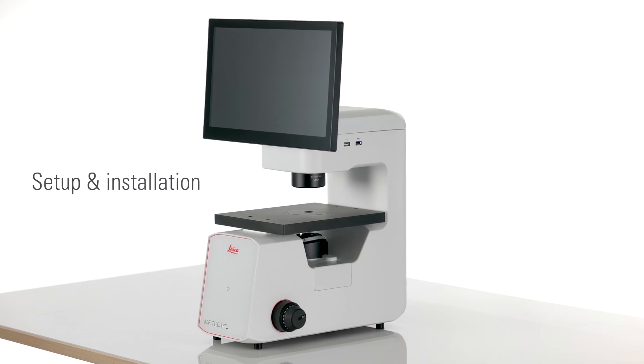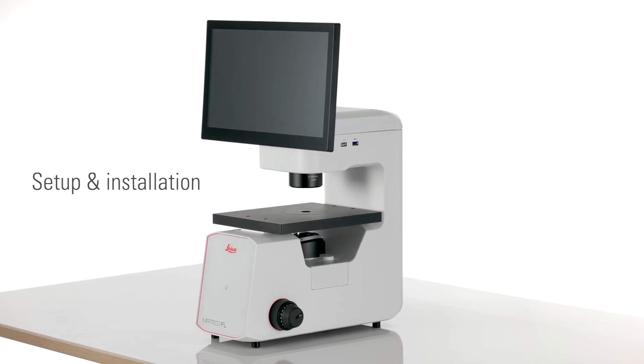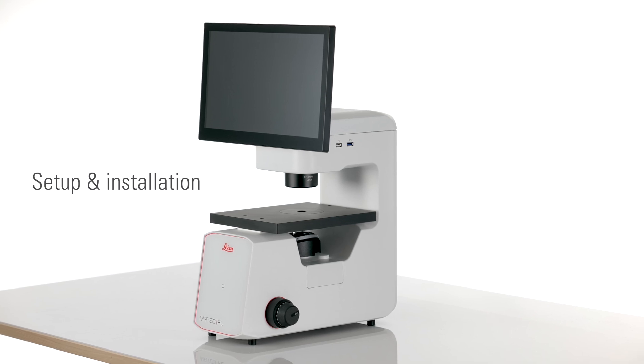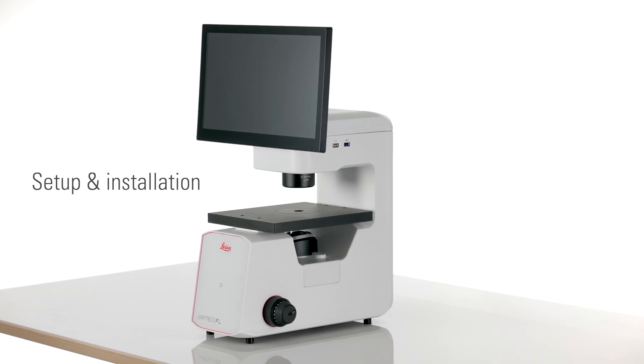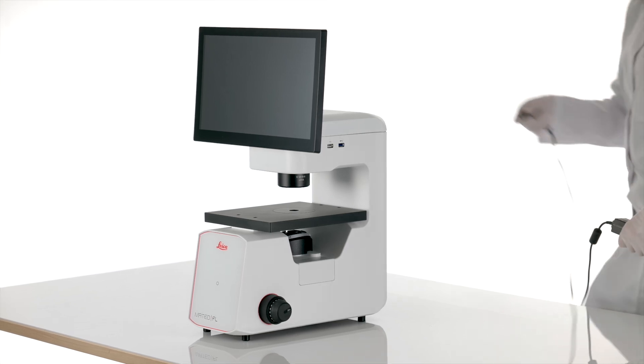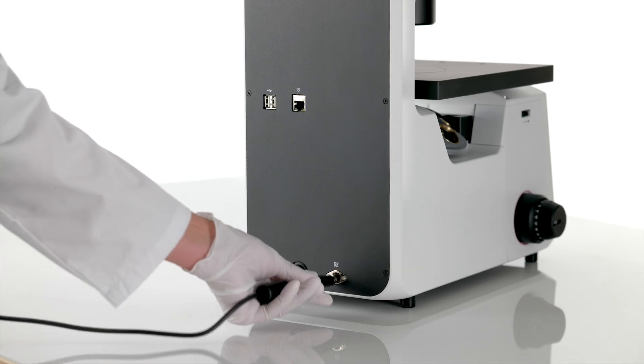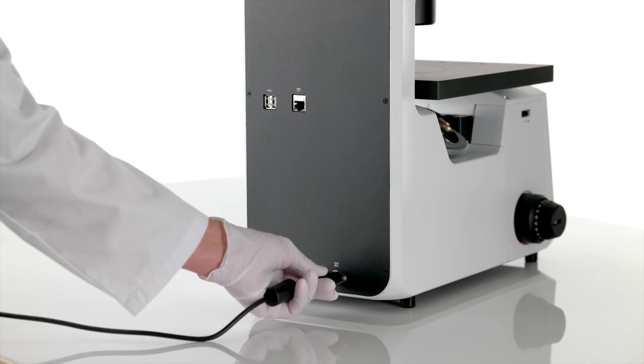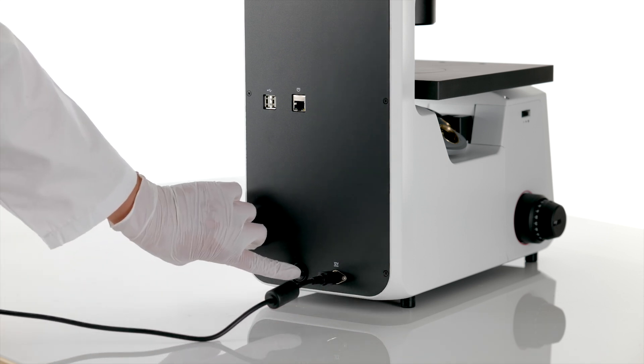And now it's time to start putting your new Mateo FL together. Place the microscope body on a clean, stable surface. Connect the power cord. To turn the device on for the first time, use the power switch located at the back of the instrument.